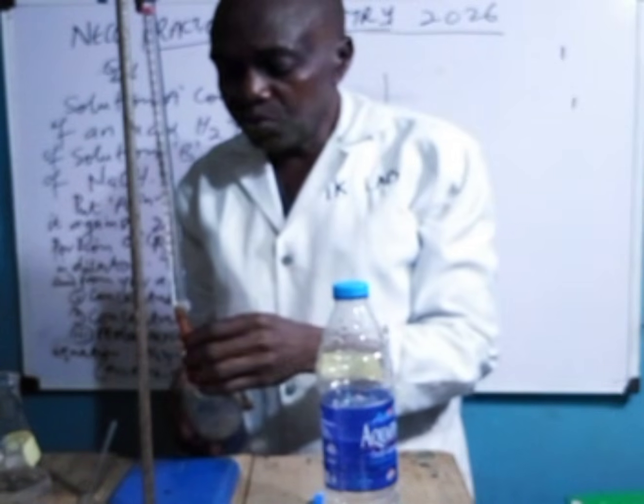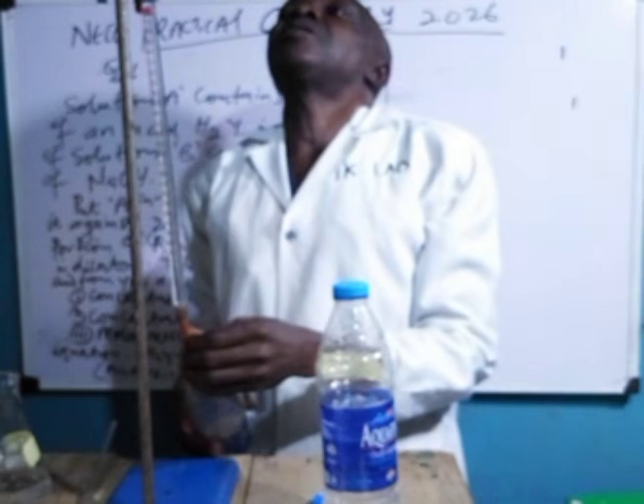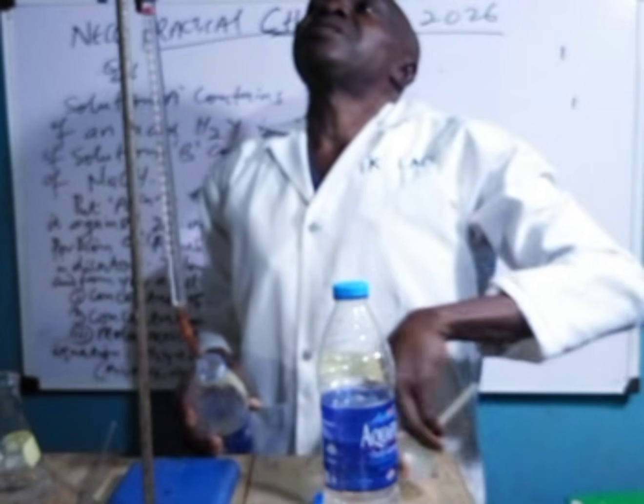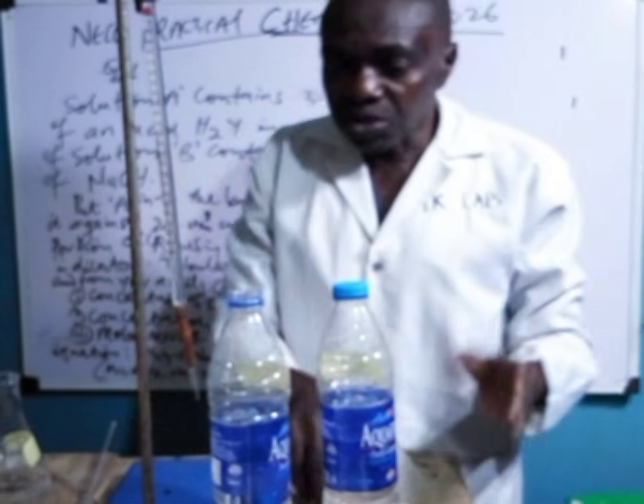What we are going to do, we'll try to remove the air bubbles from here. It has been removed. Then we now remove the funnel. Okay, it's exactly at 0. Check the meniscus line, it's exactly at 0. So this one is the acid.